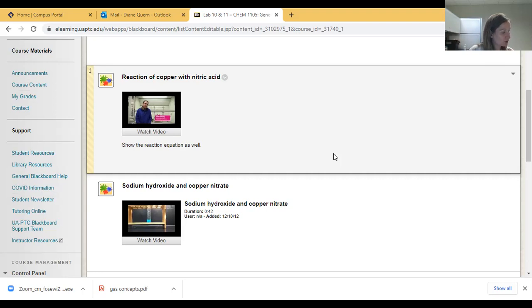And then number 2 wants you to describe the state and color of each of the following reagents. So when it asks about zinc, it's asking about that solid zinc that we just saw in that last video that was at the bottom of the flask, that blackish gray powdery solid. NO2, that was the first reaction, that nitrogen dioxide gas that formed.